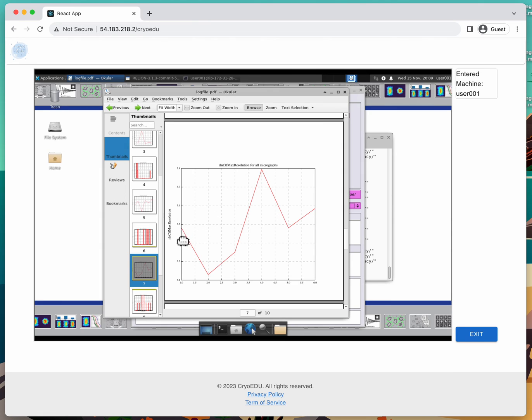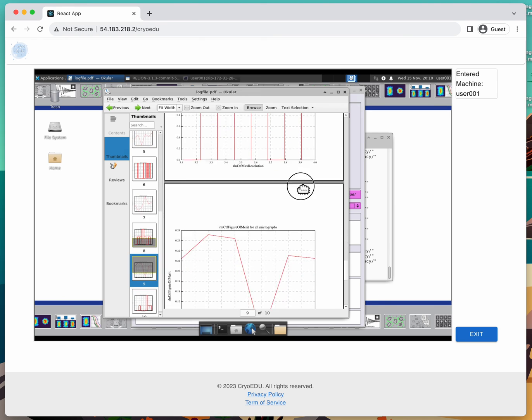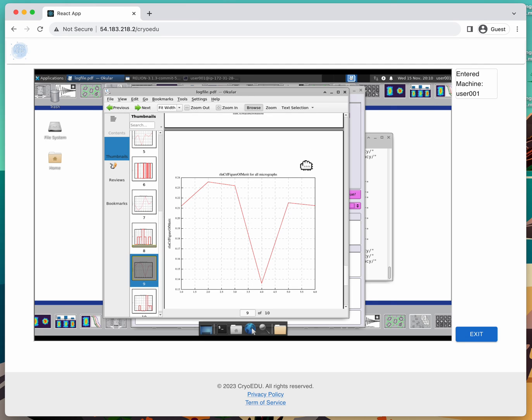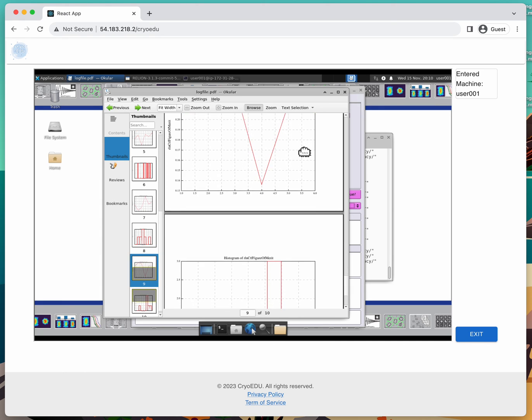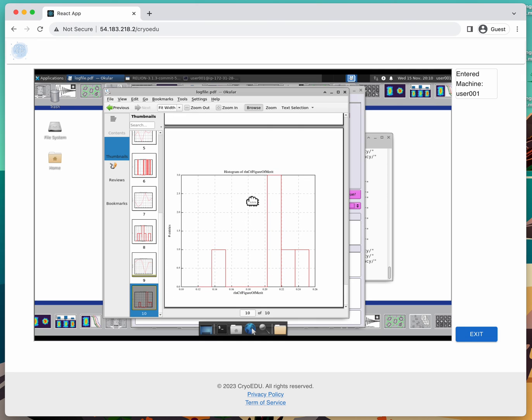And so here you have resolution, so it should be high. It should be close to 3 or 4 angstroms. It's a good number to be checking for your data sets. And then finally, just for the sake of completeness, there is one other number that it outputs, which is what's called a figure of merit, or you can think of it as the confidence score of its fit. And this could also be useful when looking at how a CTF run performed on a data set.